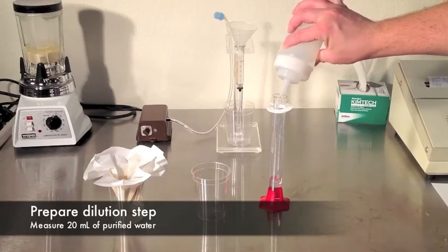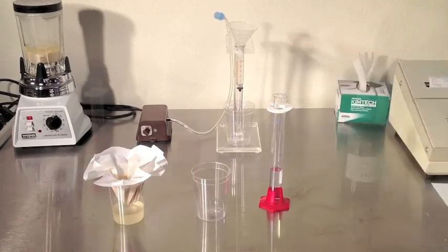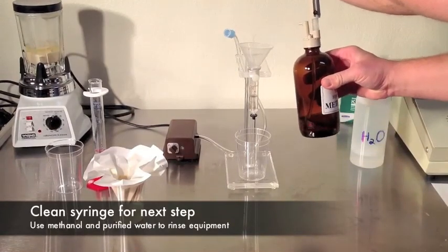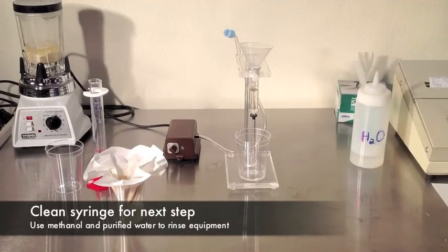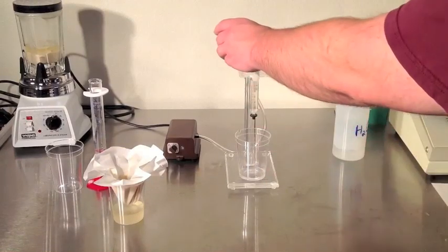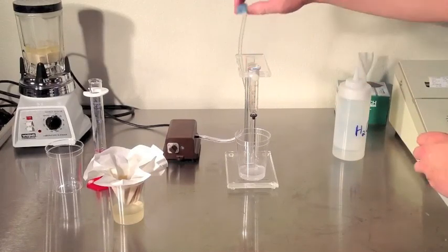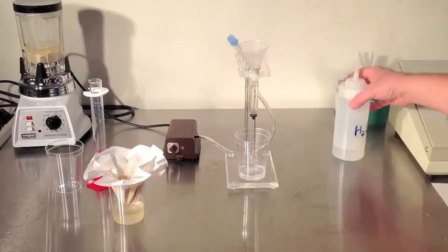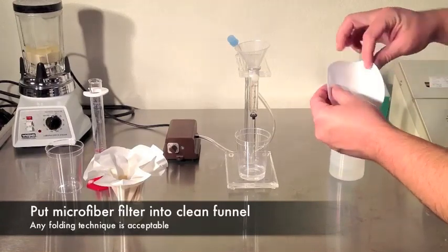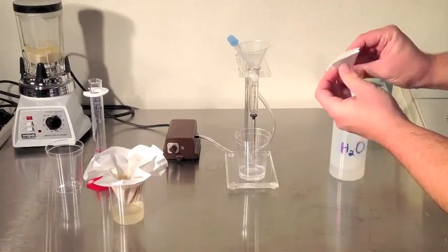Measure 20 milliliters of purified water. If you haven't already, now is a perfect time to clean your collection syringe. Use pure methanol and purified water to clean any residue left from the last test. Fold a microfiber filter to fit into the funnel. The folding technique shown allows maximum surface area for the filtration, but anywhere you'd like to fold it is just fine.